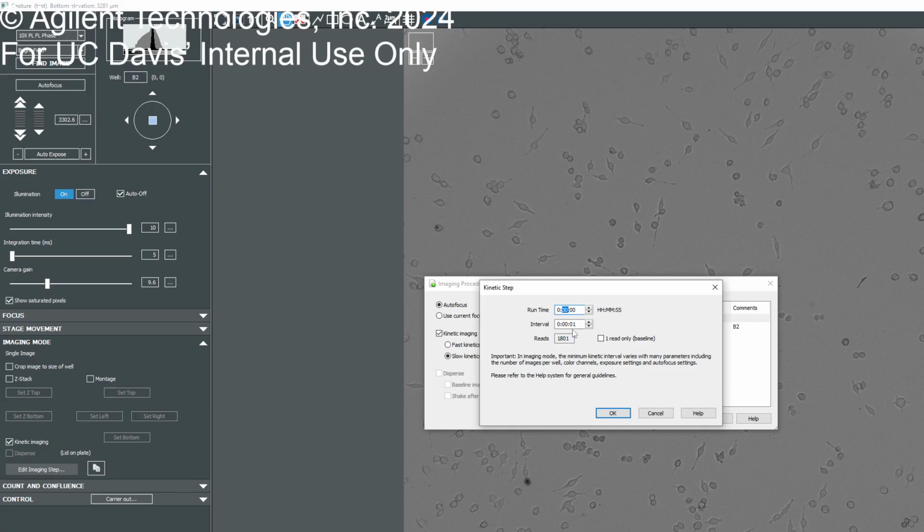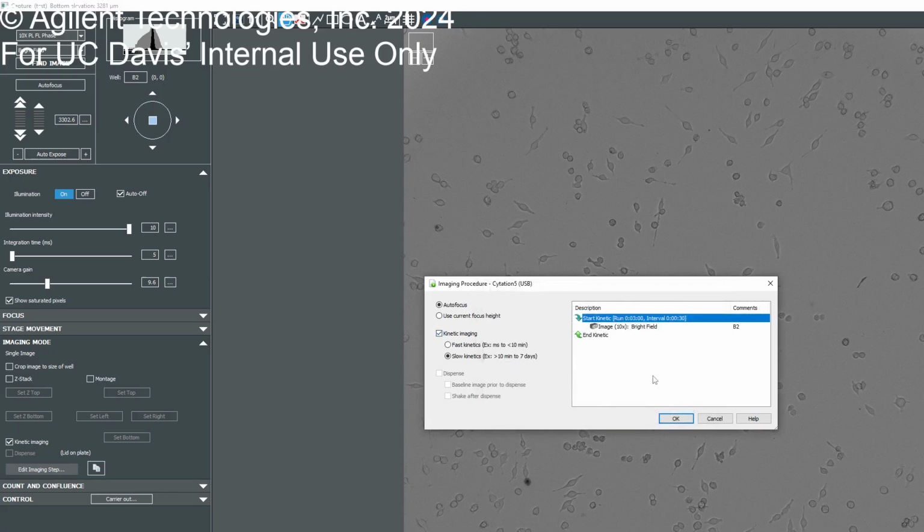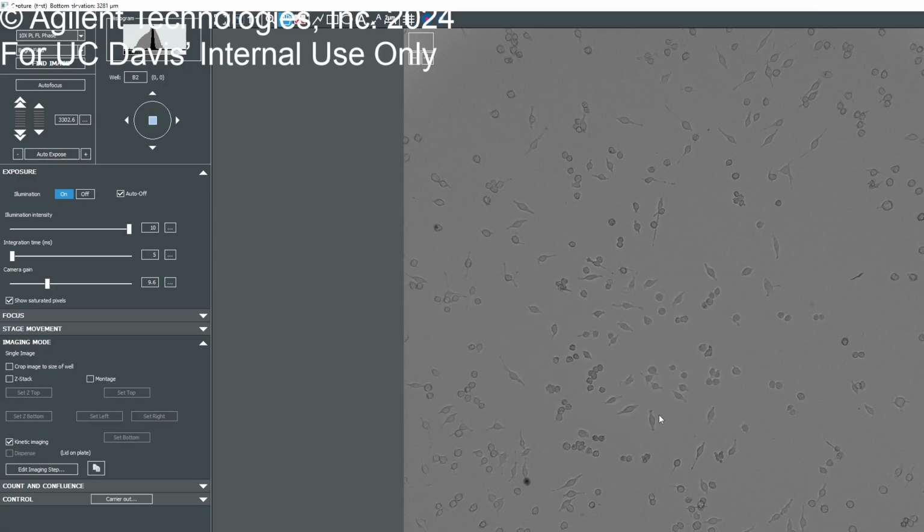Right? Yeah, and then it's set every second for now. So maybe we can change it to every 30 seconds for now, just to make it fast for the practice. And then just set it to maybe 3 minutes. Yeah, for now. And then click OK. And one more time, click OK. And then just capture this.